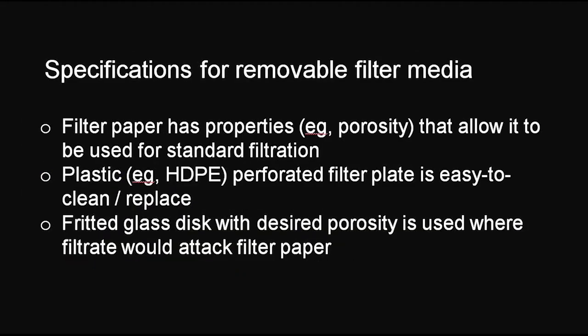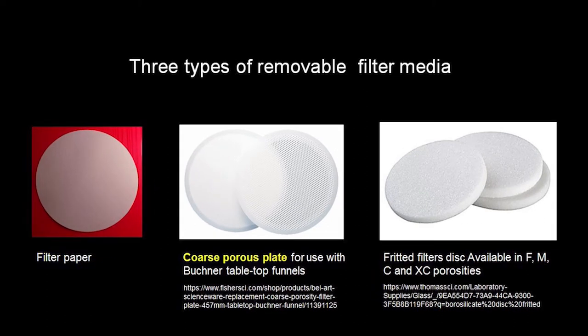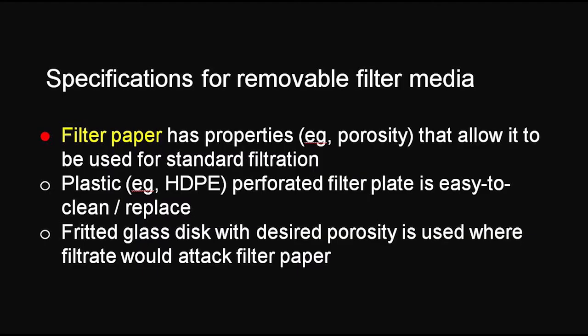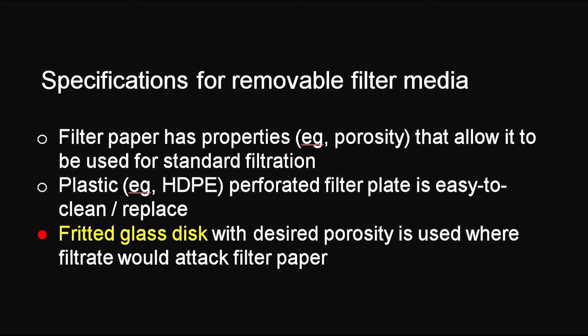Some vacuum filter funnels have removable filter media. Common examples are filter paper, plastic perforated filter plate, and fritted glass disc. Filter paper has properties such as porosity, particle retention, and volumetric flow rate that allow it to be used for standard filtration where solutions are not particularly aggressive. High-density polyethylene perforated filter plate is easy to clean or replace. Fritted glass disc with desired porosity is used where filter paper cannot withstand the chemical attack of the filtrate.